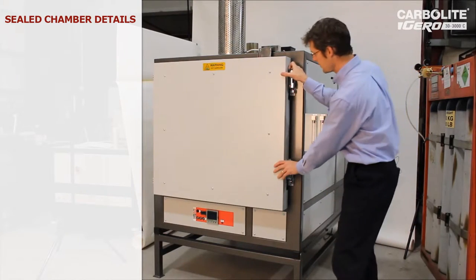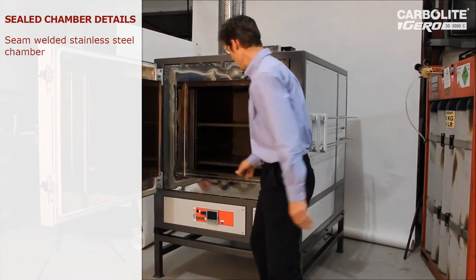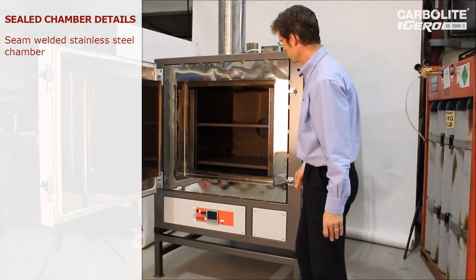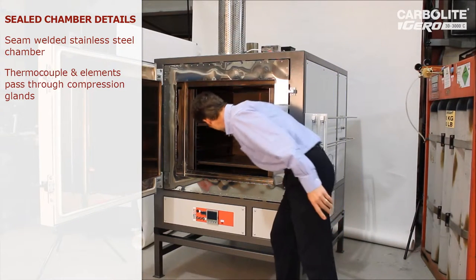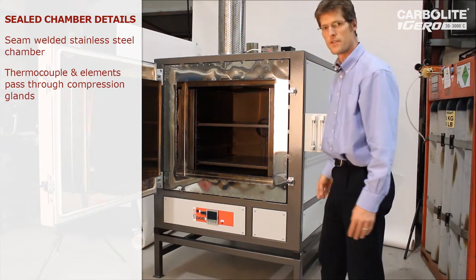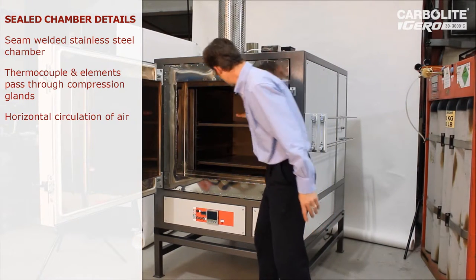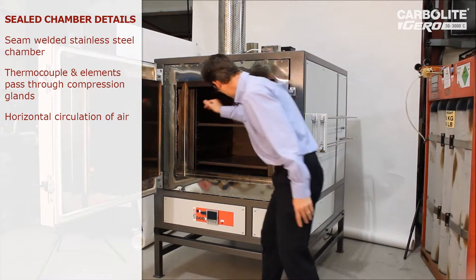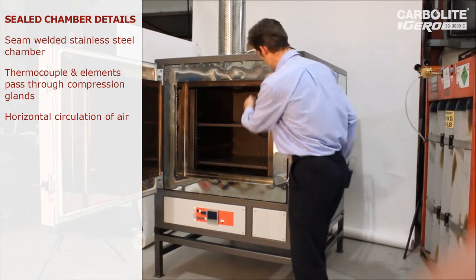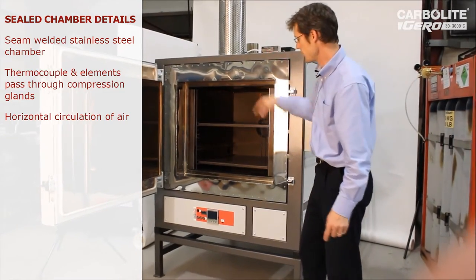Looking inside the chamber, the way we make this fully sealed is by welding all the seams to make a sealed box. The thermocouples and elements — you can see two thermocouples at the back — come through compression glands which fully seal them. Air circulation is produced by the fan at the back, which sucks into those vents and blows air out of two slots on either side of the chamber, giving a generally horizontal circulation of air.